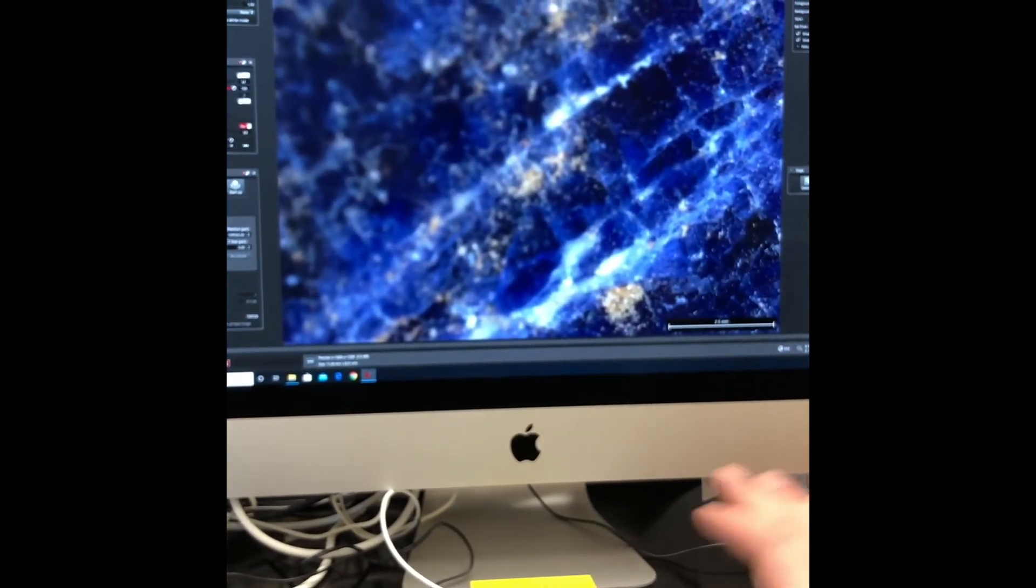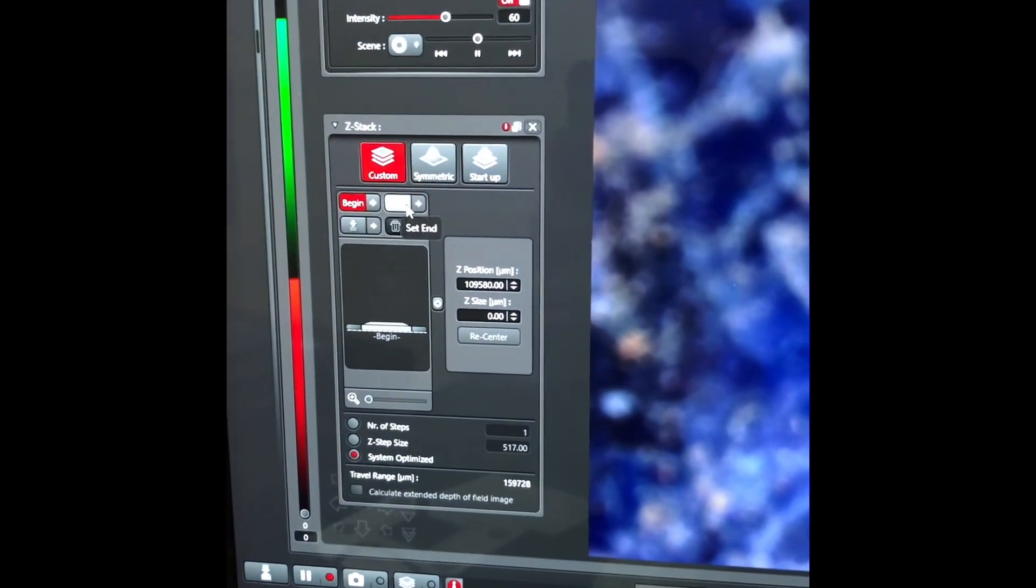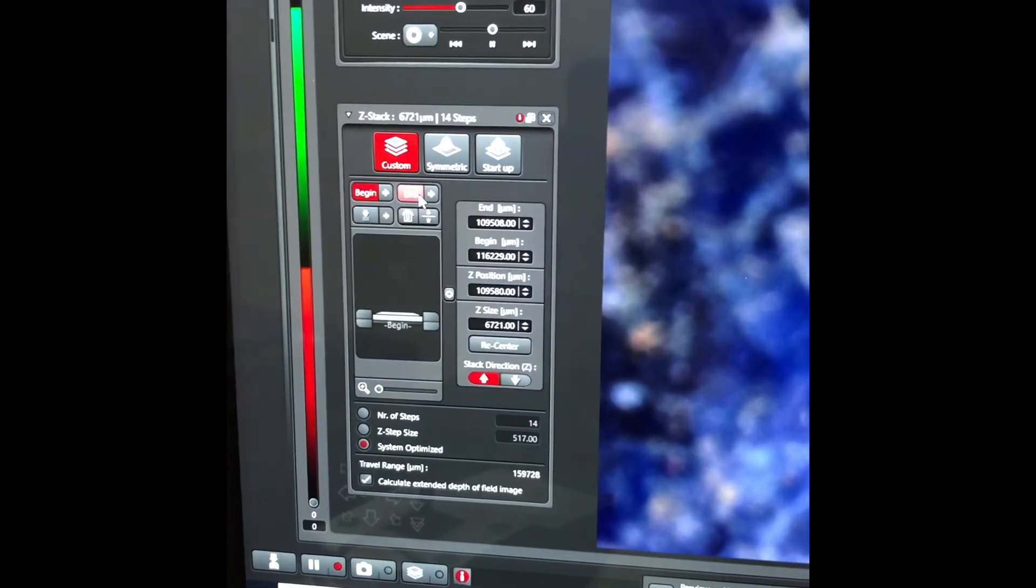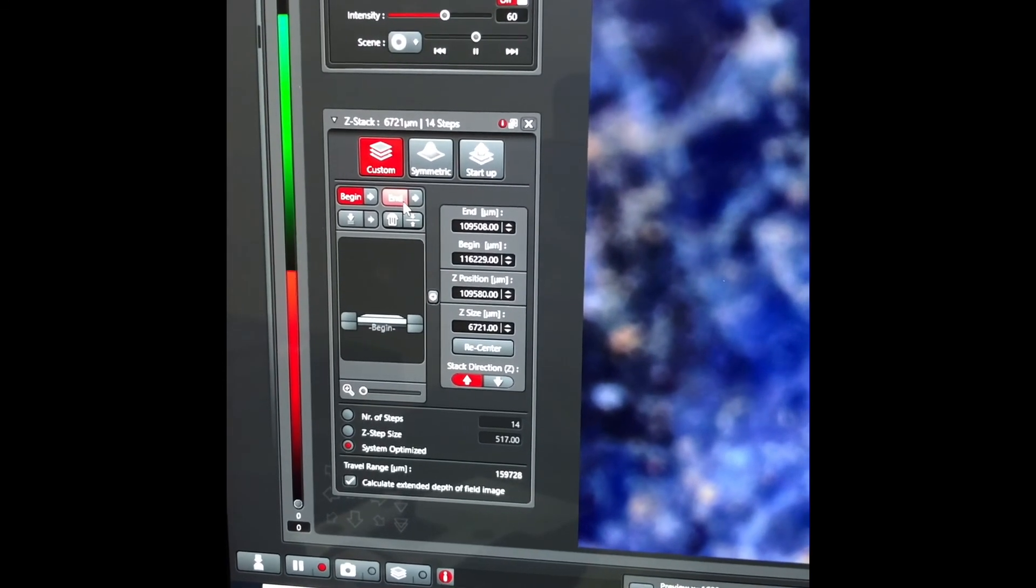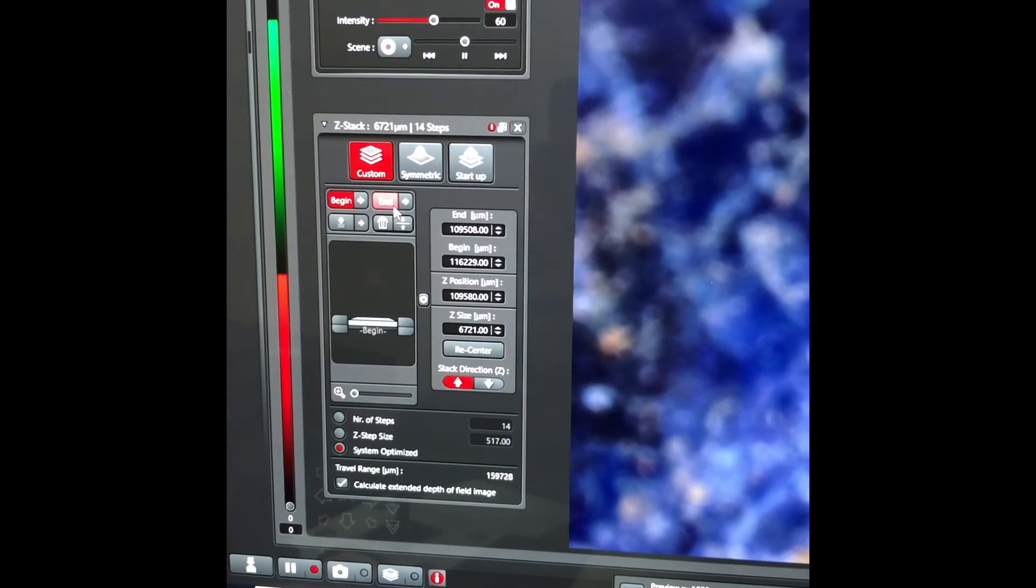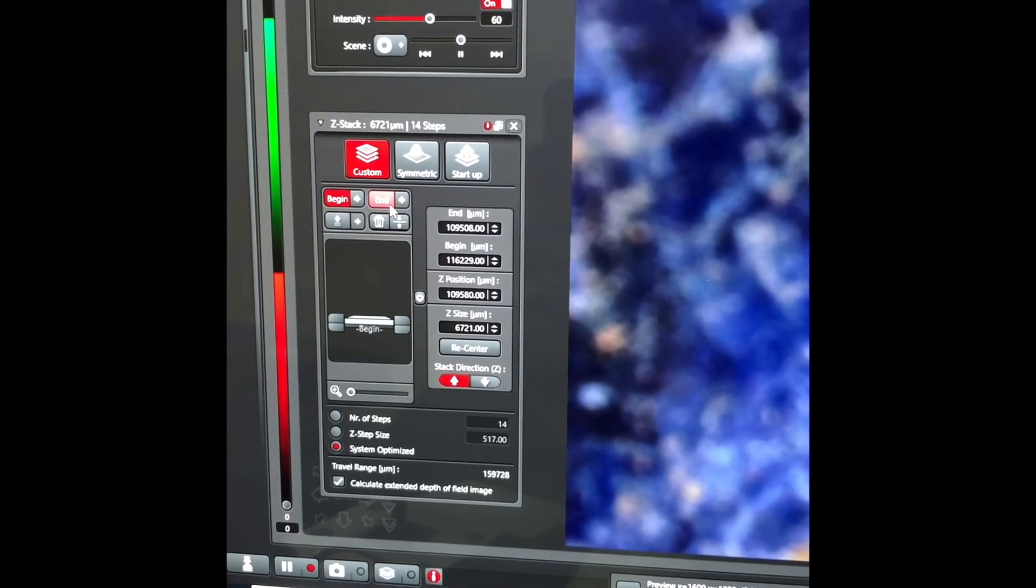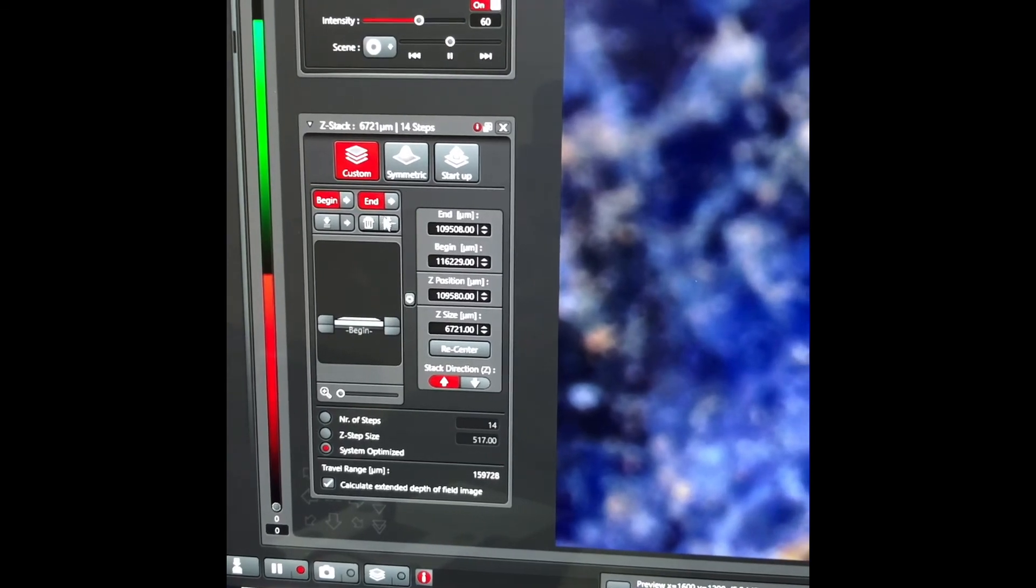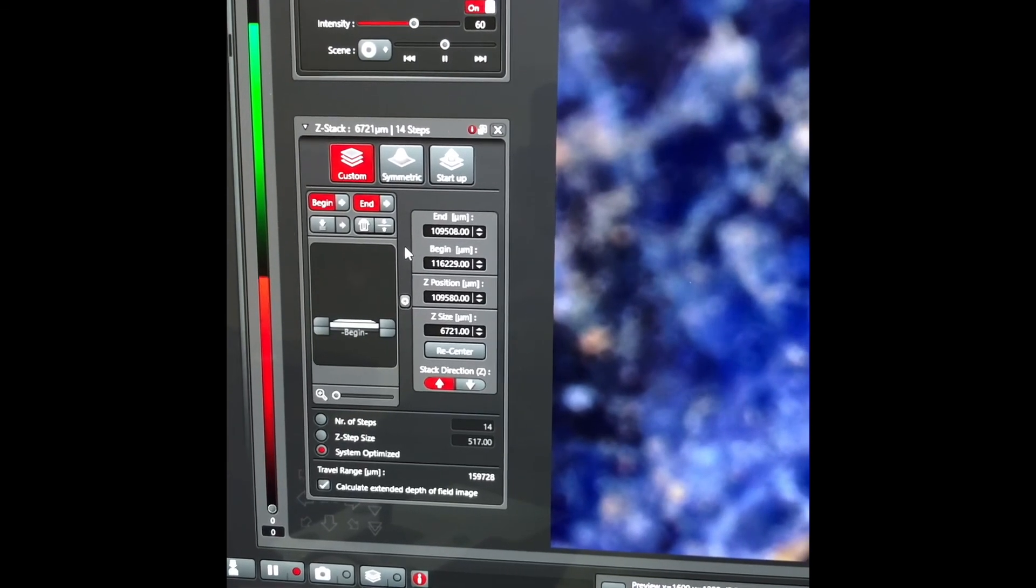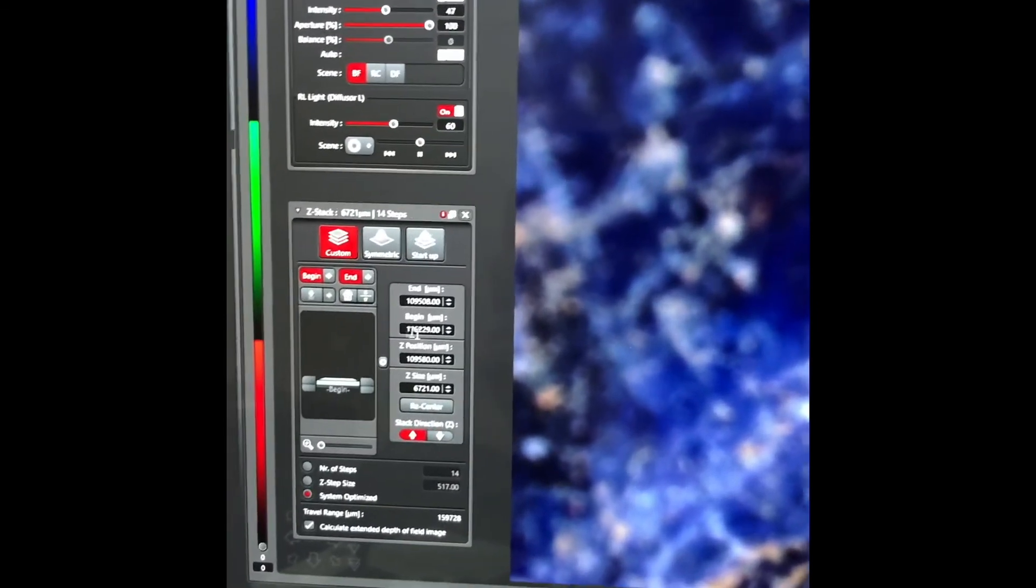All right, and press end. Now that's set the range that the microscope will start to select a series of images from and then compile them together to make sure that all of them are in focus.